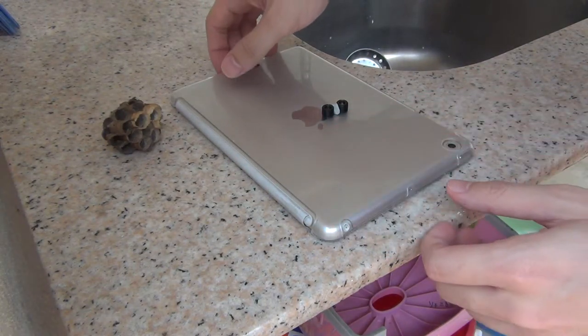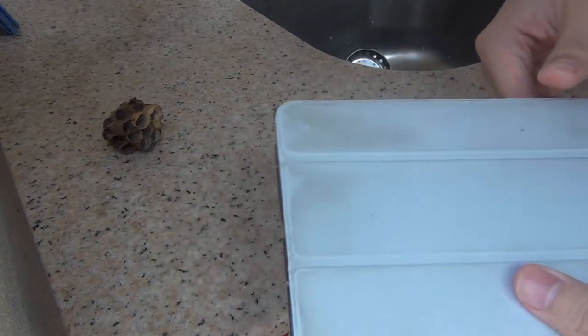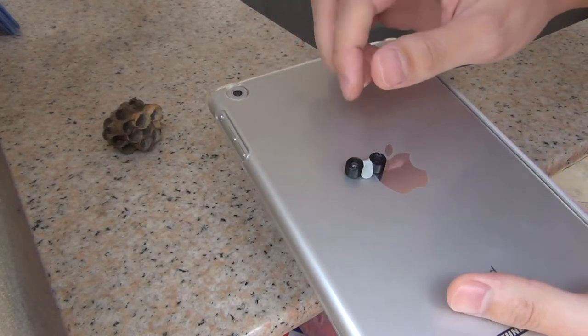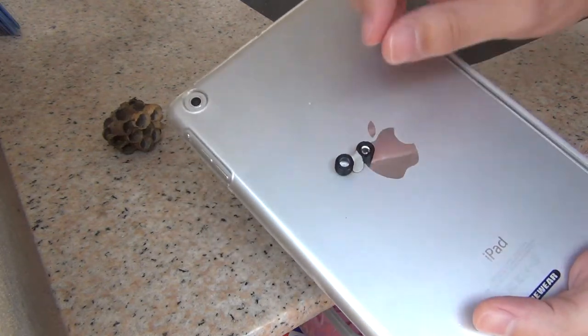Hello, Kate and friends. This is Kyle. I know I promised to make you a video to explain how my glass bead microscope works. It's actually pretty simple.